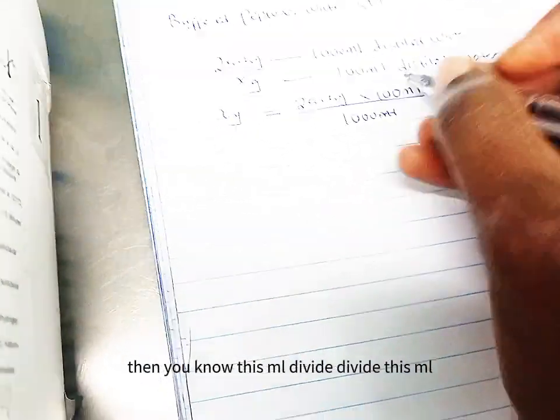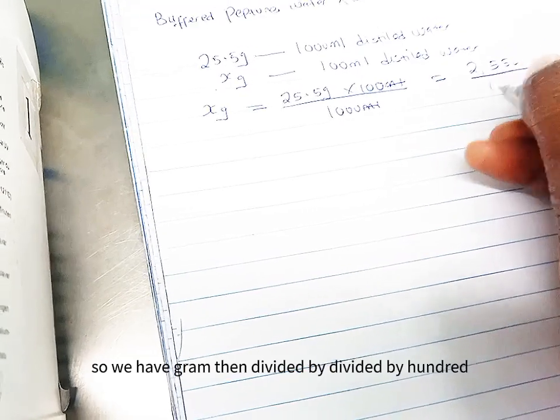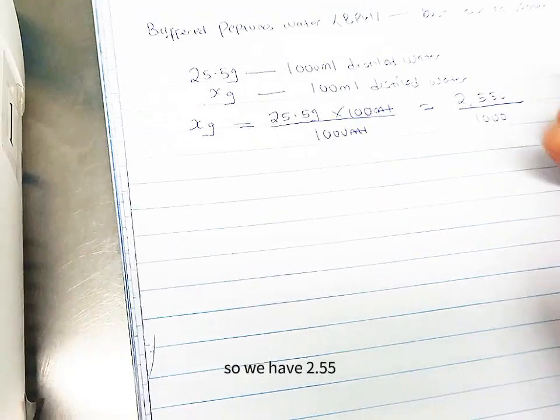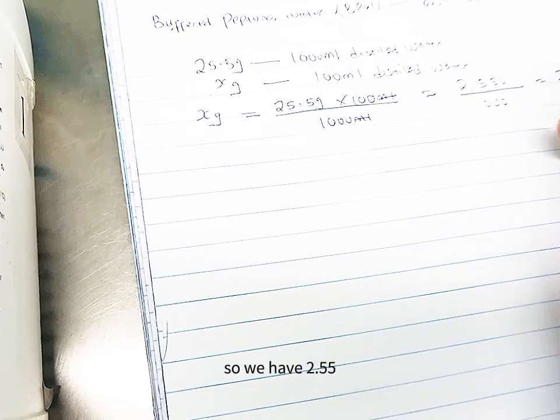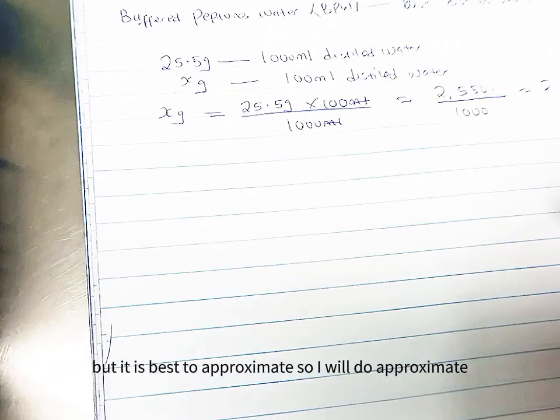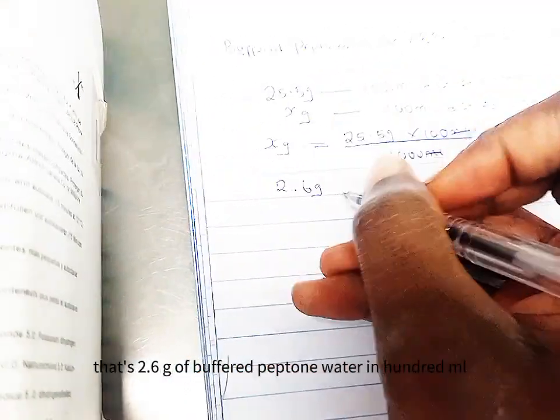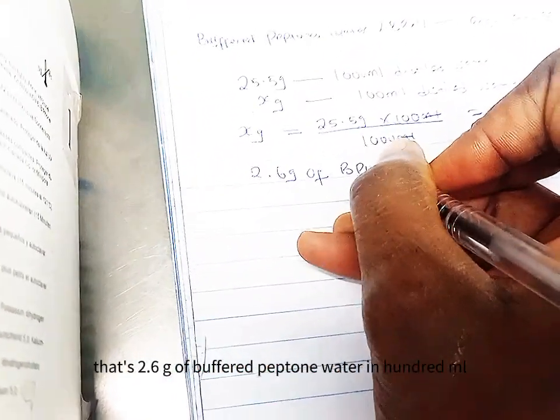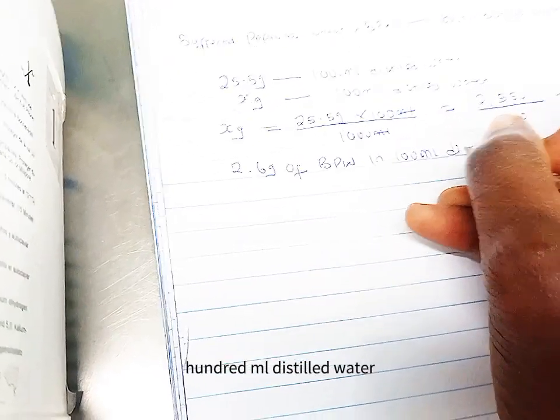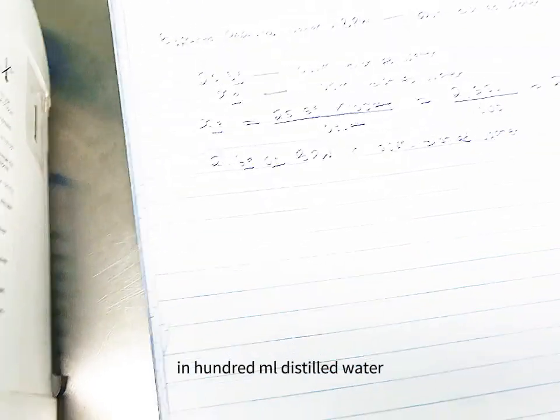Then ml divided by ml cancels, so we have gram, then divided by 1000. So we have 2.55 gram if you make use of your calculation, but it is best to approximate, so I will approximate to 2.6 gram of buffered peptone water in 100 ml distilled water.